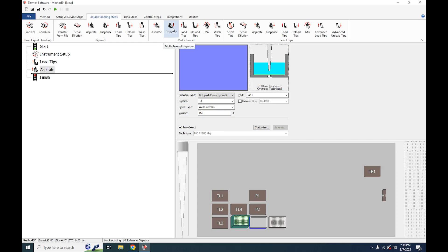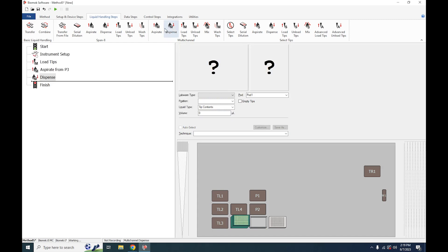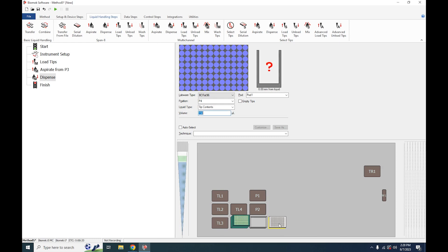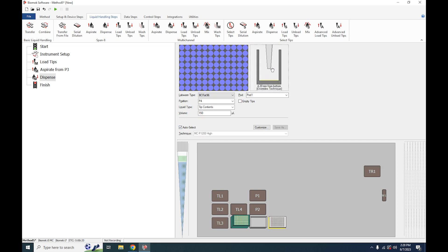Next we will choose our dispense step. Click on Dispense or drag and drop a dispense step into the position you need to. Click on the position you wish to dispense into and do the same as we did with the aspirate step. Either hit auto-select or choose your technique. You can then choose how far from the bottom you'd like to dispense into the plate, and define how much volume you'd like to dispense or whether you'd simply like to empty the tips completely. This will auto-fill the volume section to the maximum of whatever the tip contents are currently.